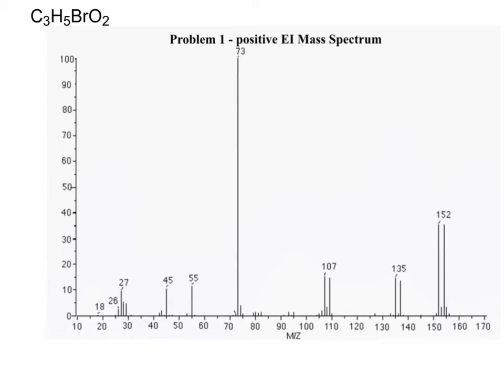So now I'm going to go ahead and figure out the degrees of freedom. Remember, when determining degrees of freedom, you treat oxygens as if they do not exist, and halides as if they are an extra hydrogen. This is because oxygen is capable of making 2 bonds, and a halide is only capable of making 1 bond, so it acts as if it's a hydrogen.